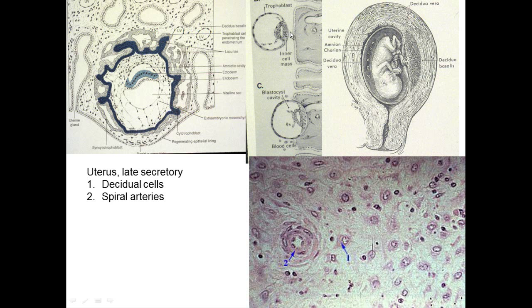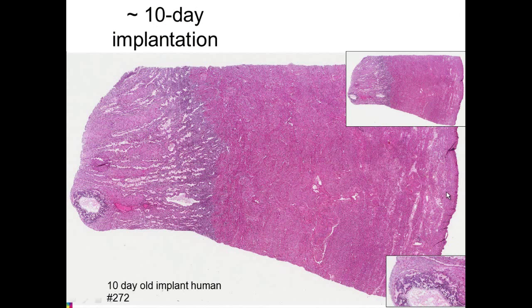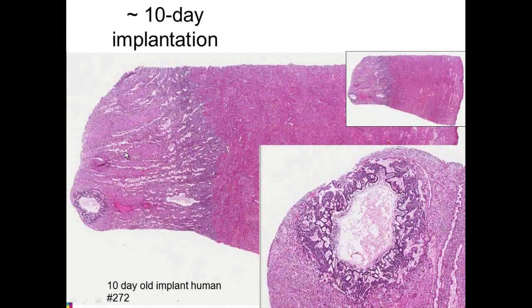So you have implantation of the blastocyst. It attaches to the uterine wall and then becomes embedded in the endometrium itself. Placenta is developed right in through here. The connection is a nutritional connection to the uterus that will go through an umbilical cord to feed the baby. And here we see the myometrium, the endometrium, and this particular one has already got an invasion of a 10-day-old implantation.